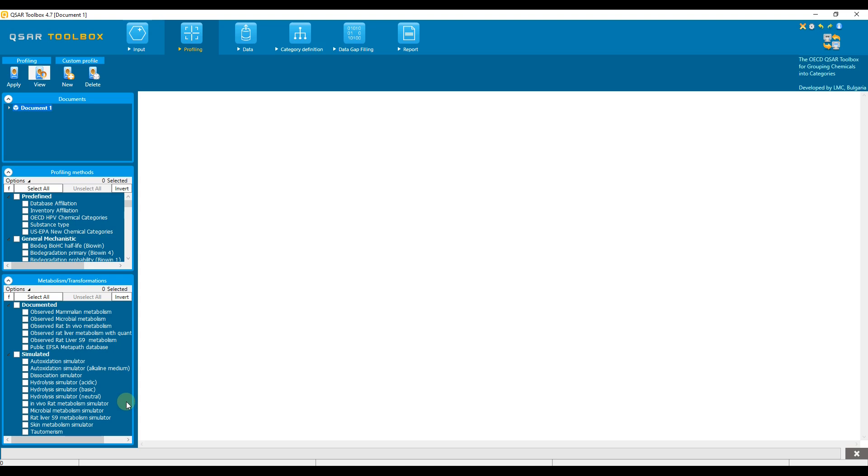The simulators are endpoint-specific and depending on the target endpoint, specific simulators must be used. Please note that only phase 1 metabolites are generated for the purposes of the QSAR toolbox. Let's get started.